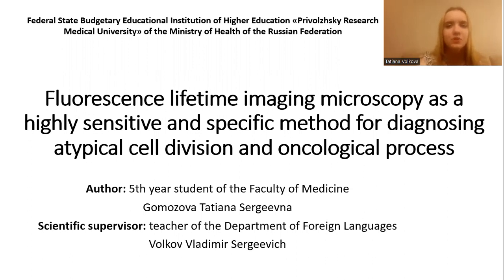I'm a student of Privolzhsky Research Medical University, and today I'm going to tell you about fluorescence lifetime imaging microscopy as a highly sensitive and specific method for diagnosing atypical cell division and oncological processes.